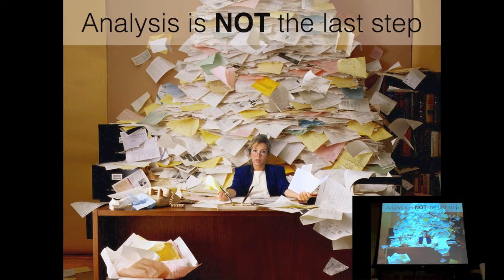So I would strongly urge you, once you've got that experiment working, to take the week off and try to analyze some data in order to really understand how you're going to analyze the data, what the critical aspects of the data are that make it easier or harder to analyze, and to give you a realistic expectation about how long it's going to take you to analyze your data. It may seem like that week is a bit of a waste of time when you think you've got everything working, but it's sure a hell of a lot less of a waste of time than having to redo months and months of experiments, not to mention less expensive.